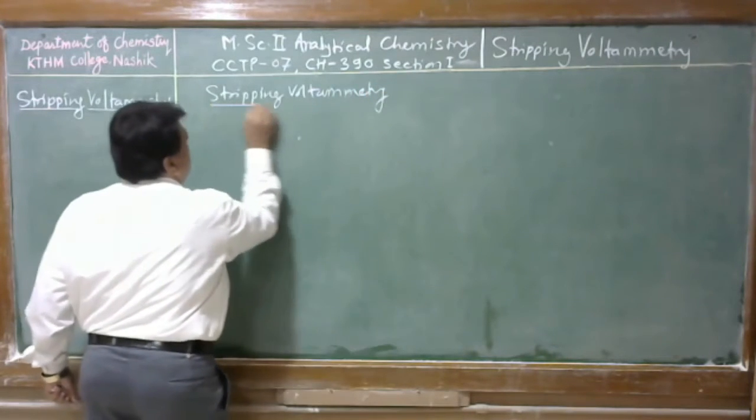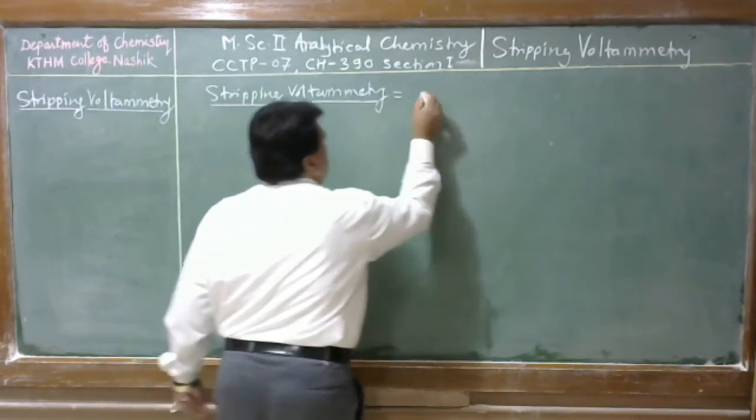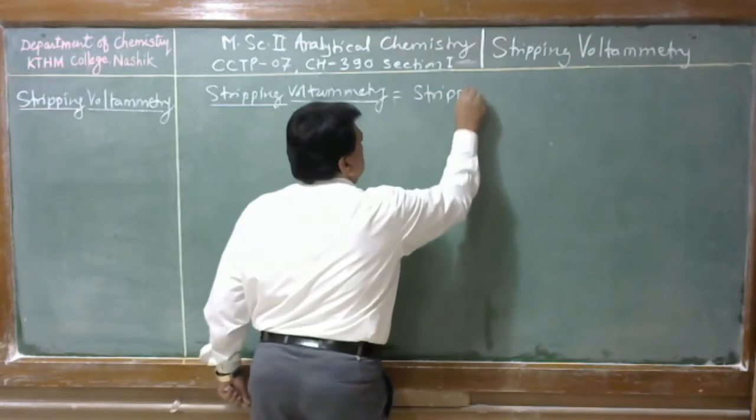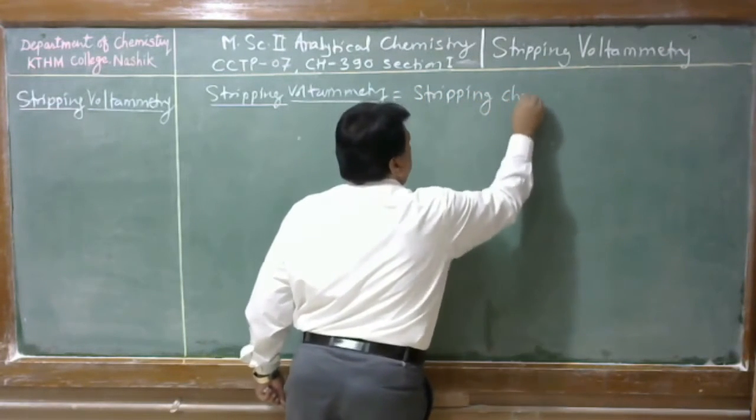Stripping voltammetry is also called stripping chronoamperometry.